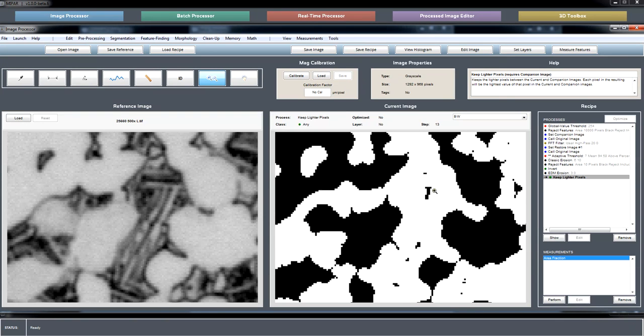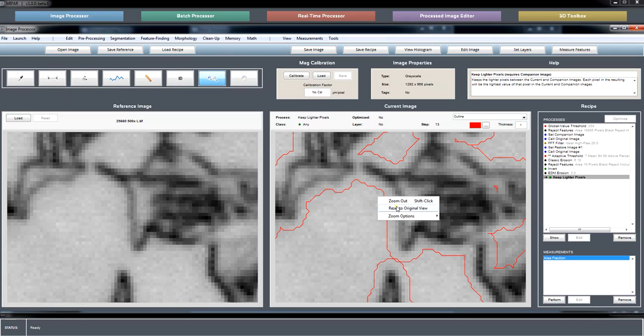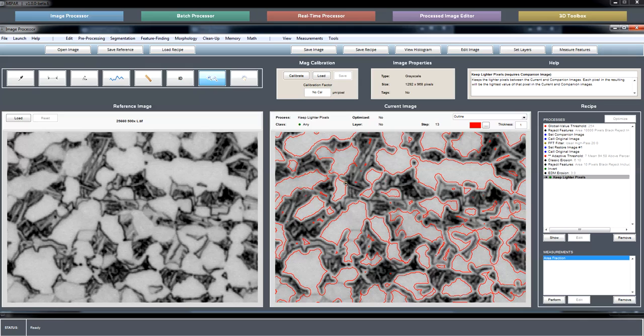We're going to have some residual pieces of laths. I'm not sure why we're having an issue there with the zoom. I'll make sure that isn't a bug. The zoom should stay as you have it set. Some of these pieces that remain after the erosion need to go away.